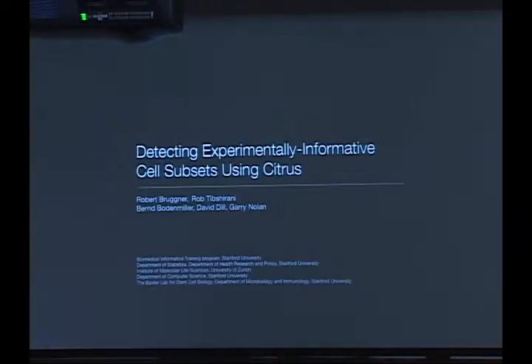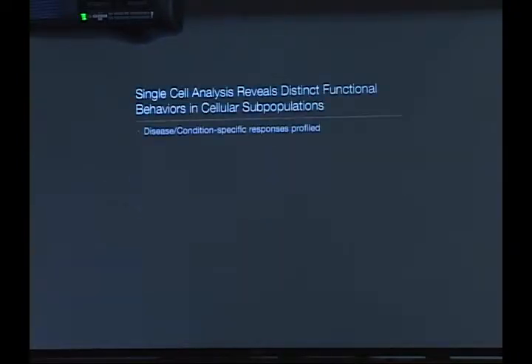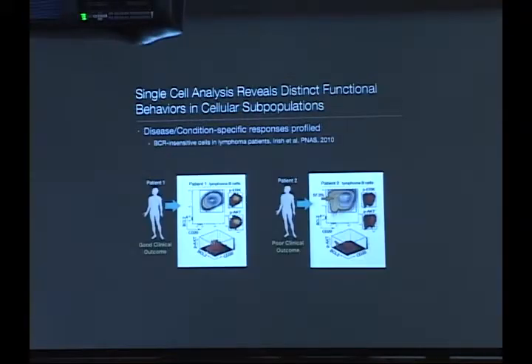Maybe you have a bunch of AML patients and you have some clinical outcome that you've measured, let's say relapse-free survival time, and you want to ask the question, are there any cell subsets that are predictive of time to relapse in your AML patients? These are the kind of hypotheses that we're talking about. Finding associations between the data that you've measured and some external experimental endpoint that you are interested in testing for an association with.